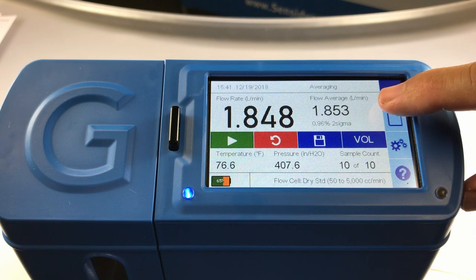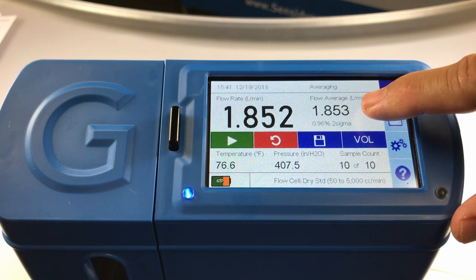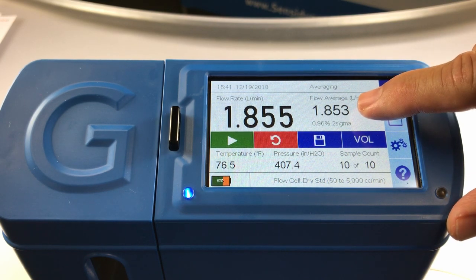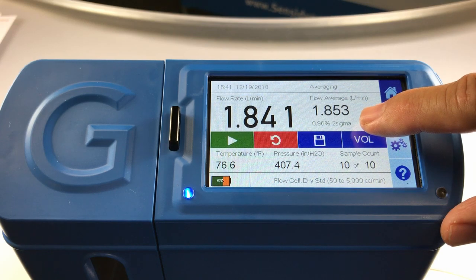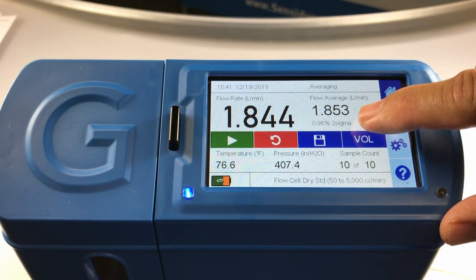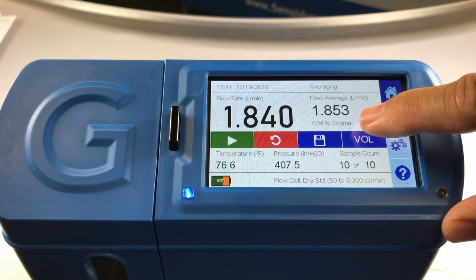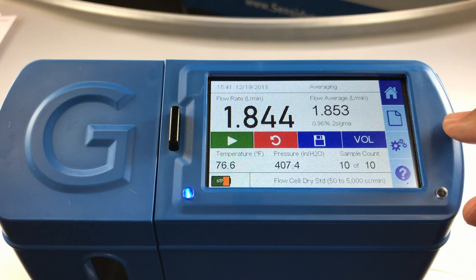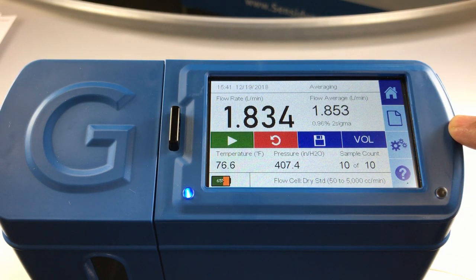Now you will see your flow average displayed in the upper right-hand area. Below it you will notice that the two sigma is in green print and is 0.96 percent, which is within our 2.5 percent threshold deviation.